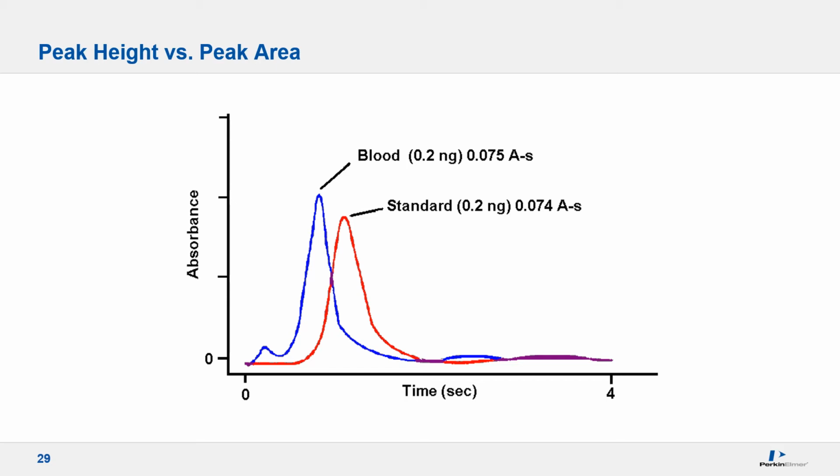The combination of max power heating and the Lvov platform goes a long way towards eliminating non-spectral or vapor phase interferences. However, one potential problem still exists. The rate at which atoms are released from the platform surface into the furnace environment will still be controlled by the sample matrix in which the analyte resides. Any measurement technique which depends on atomization rate solely, such as peak height, would therefore show matrix effects if there is any difference in the rate of formation between samples and standards.